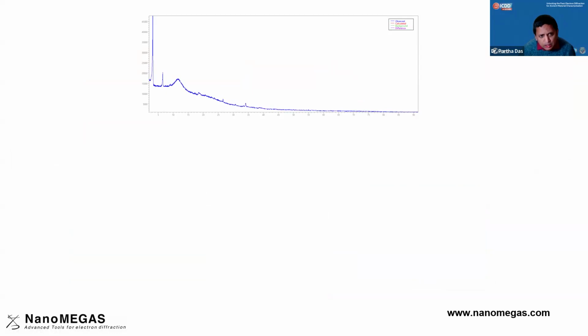First, powder diffraction data was collected by the scientists at the British Museum, and you can see the powder diffraction is extremely poor. There are only a few peaks. There was no match in the ICDD database with this powder diffraction pattern, or the other way you can put it, you can almost fit everything with this quality of diffraction pattern. And then they also matched it with their in-house reference library of corrosion products. It did not match anything else.